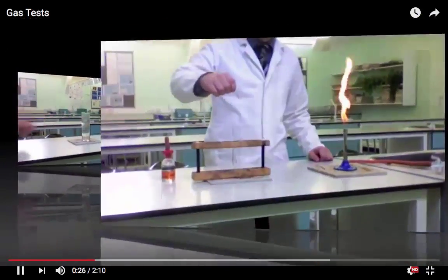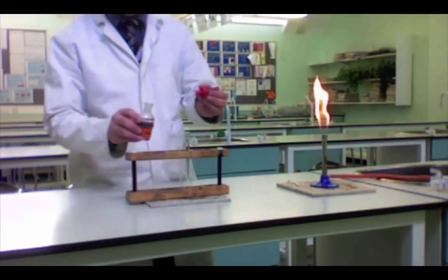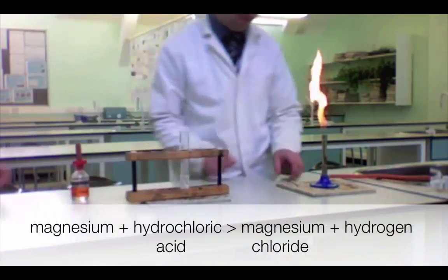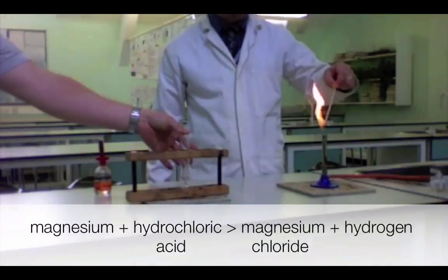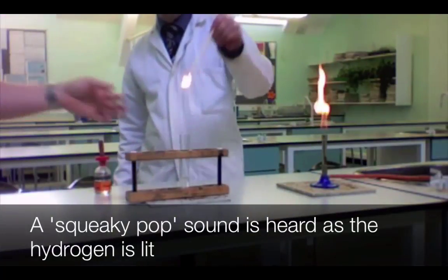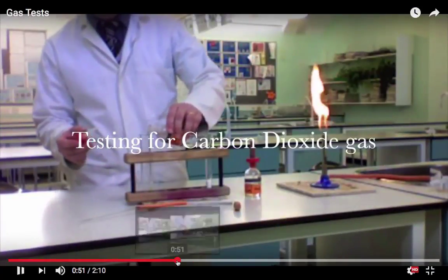Okay, now the second kind of gas that can be produced is hydrogen gas. And when you are producing hydrogen gas, you're actually going to get a really high-pitched, almost barking sound, and sometimes it can startle you a little bit, so make sure you're prepared for it. Try to listen to what sound is being made. So when he sticks this down in there, listen for the sound. It makes a popping sound. So let's hear that one more time.